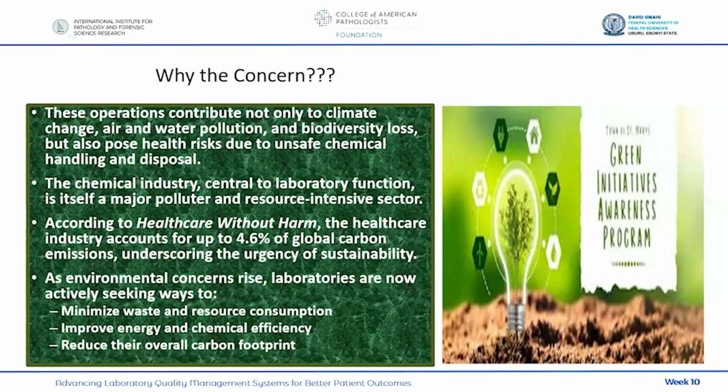Now, according to Healthcare Without Harm, this is a group, the healthcare industry accounts for up to 4.6% of global carbon emissions. And this is what they looked at, and they saw the need to bring the laboratory into this green initiative. That we just have to bring the laboratory, they just have to embrace the green initiatives. Okay. So the laboratories don't have a choice here now, because as environmental concerns rise, laboratories now have to begin to seek actively ways to minimize waste, ways to minimize resource consumption, ways to improve their energy and chemical efficiency, and overall, how to reduce their carbon footprint. It is now imperative to do that.